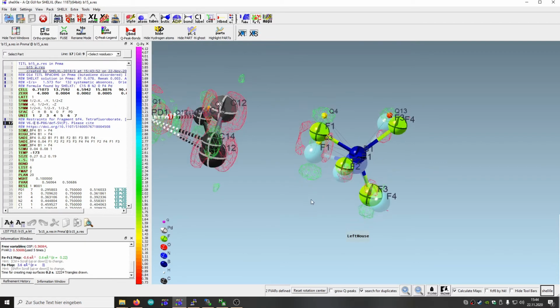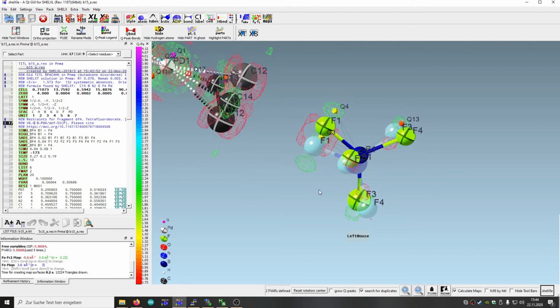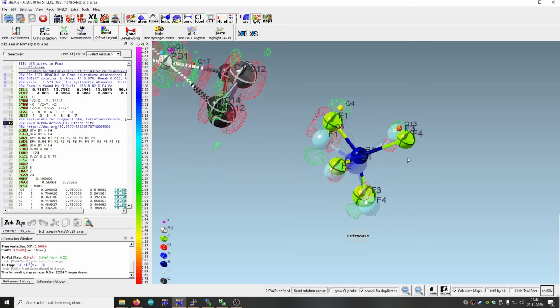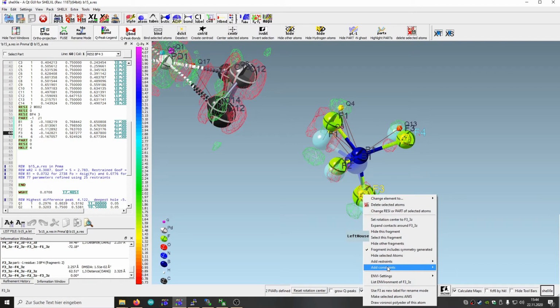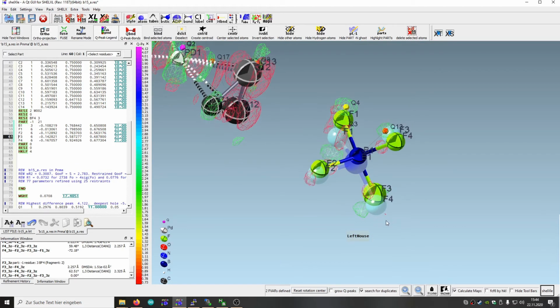And we see that several atoms are quite near to each other, so F3 and F4 are very close, so probably it's a good idea to constrain the ADPs for atoms which are very close. So let's say those should share the same ADP.